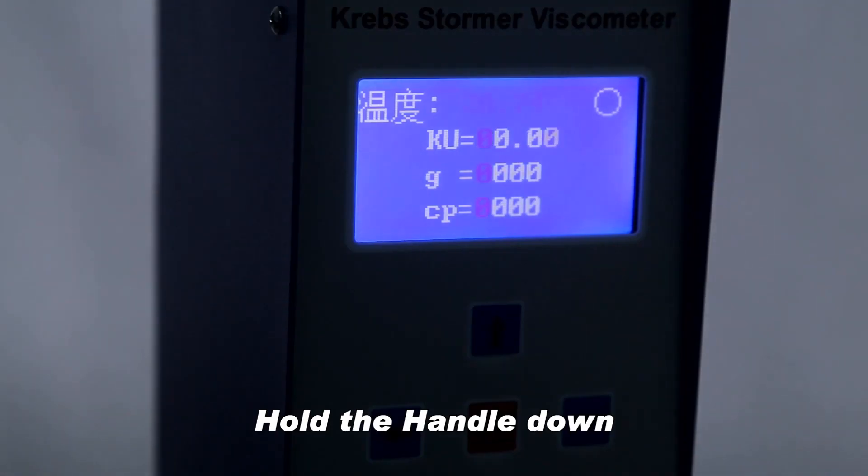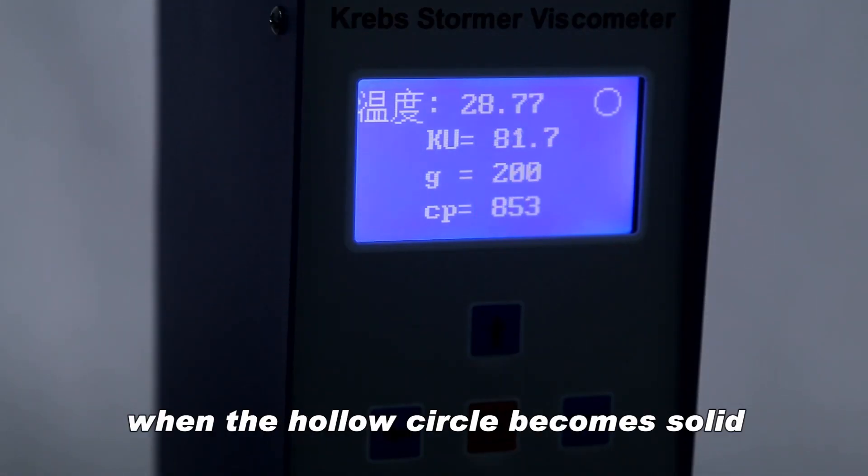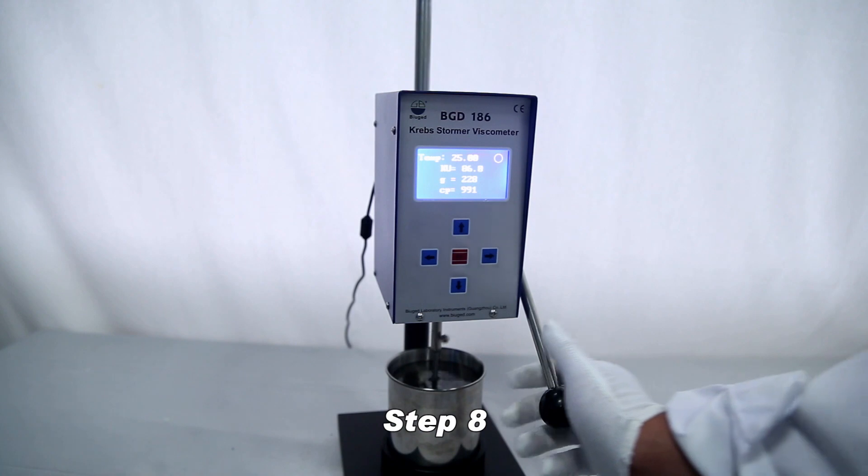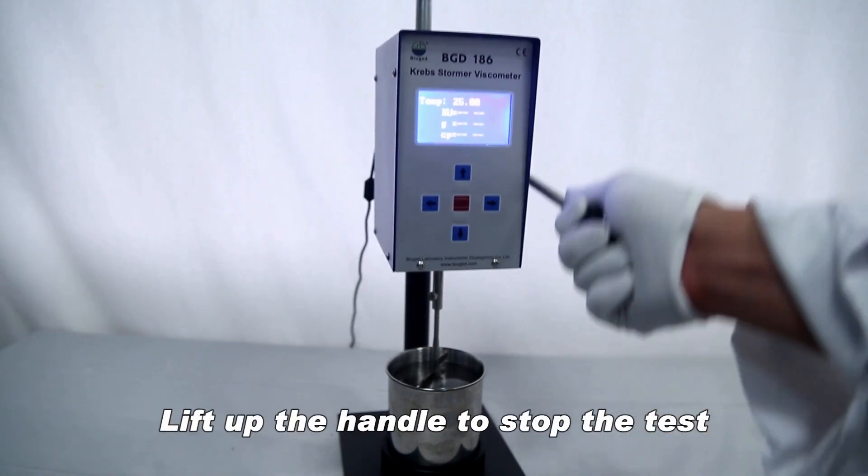Hold the handle down. When the hollow circle becomes solid, the operator can read and mark down the result on the screen. Lift up the handle to stop the test.